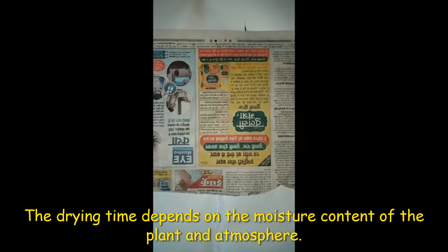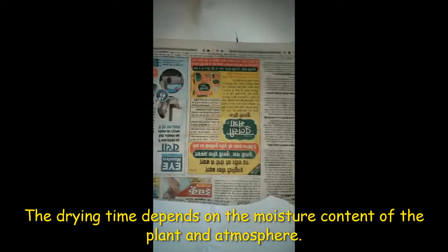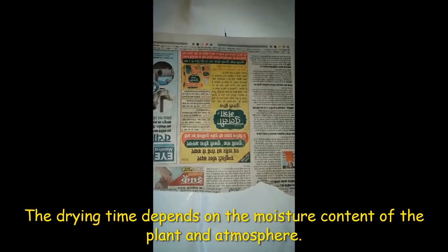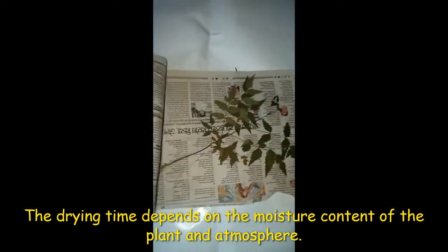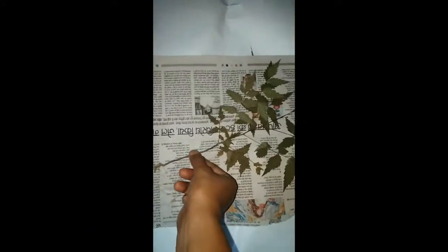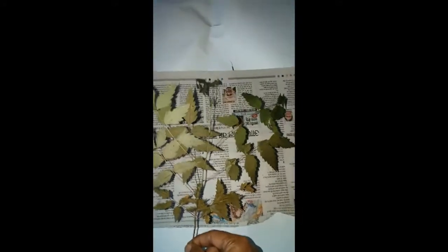After 15 days we will take out the drying sheets and open them very carefully. I kept these sheets for 15 days because this is the rainy season, so it takes a little extra time for drying. Let us see how the plants have dried. Here you can see this is a neem plant, and it has dried out very well — from the roots to the shoot, every part is dry and the leaves have not lost much of their color.